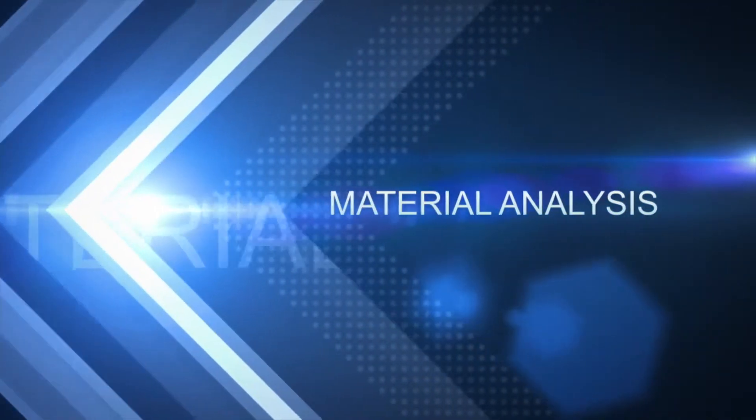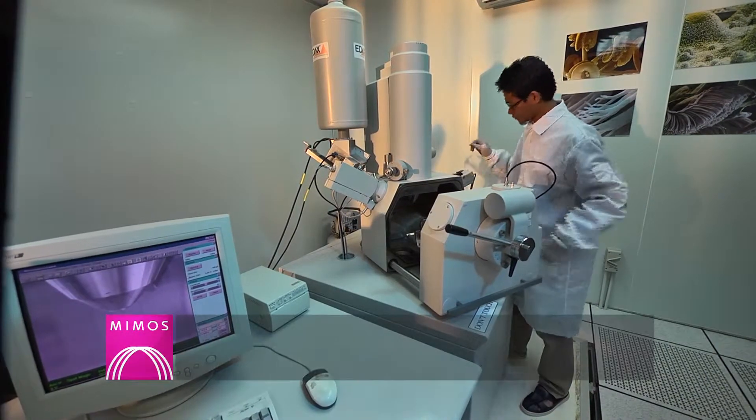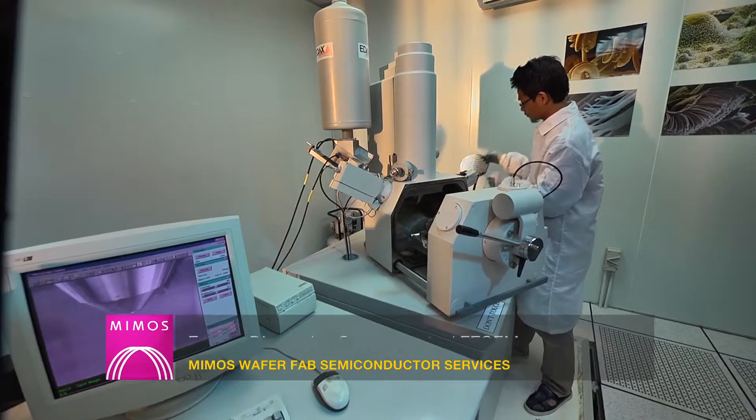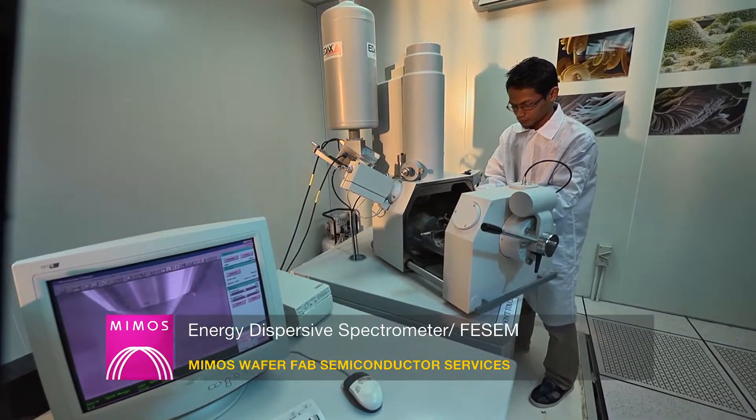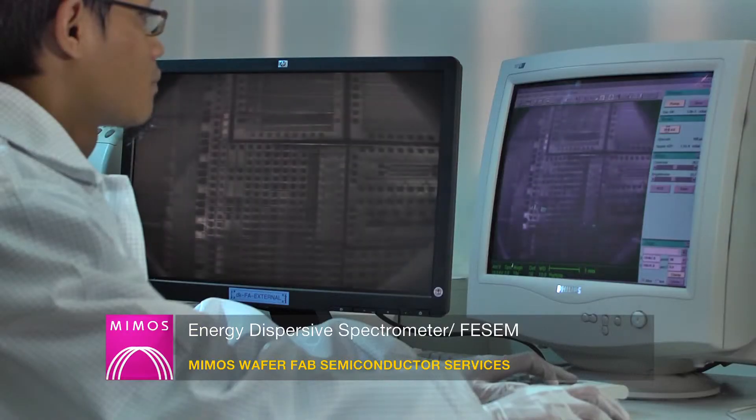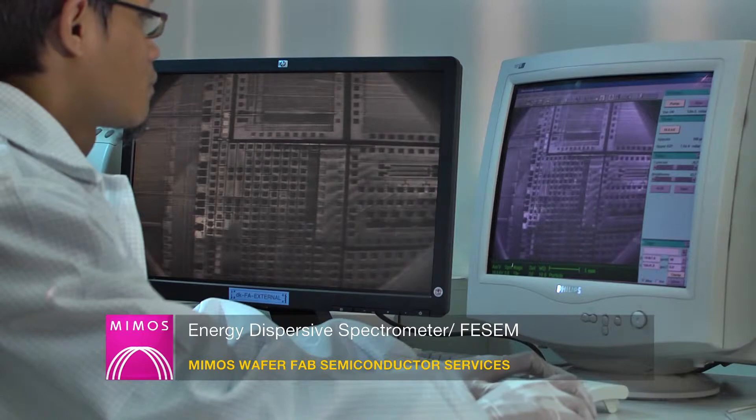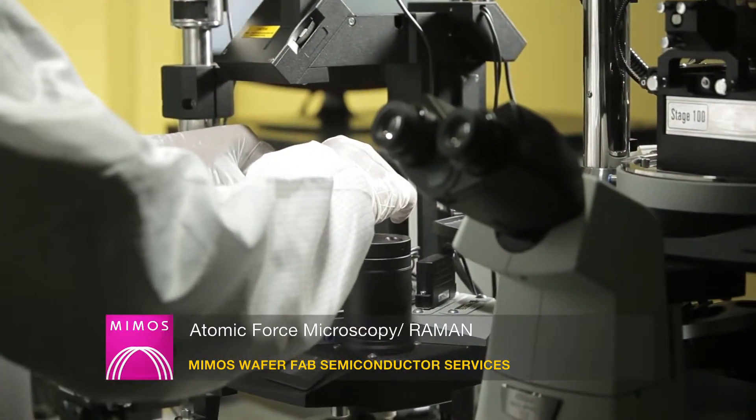Material analysis provides a better understanding of the elemental and chemical properties of failed devices. An attachment to the FEG scanning electron microscope is an energy dispersive spectrometer. The system has the capability to determine and quantify the composition of the elements and its compound.